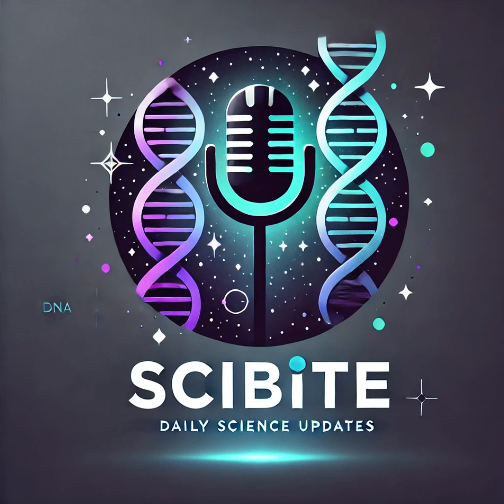With XLDOT, they were able to actually see each individual grain of the catalyst, the boundaries between them, and even tiny defects in their structure. These features, even though incredibly small, have a big impact on how efficiently the catalyst actually works. I'm curious what stands out to you as the most groundbreaking aspect of this ability to see these tiny structures. What's really fascinating is that this level of detail, we're talking about tens of nanometers here, allows us to understand how a material structure dictates its properties.